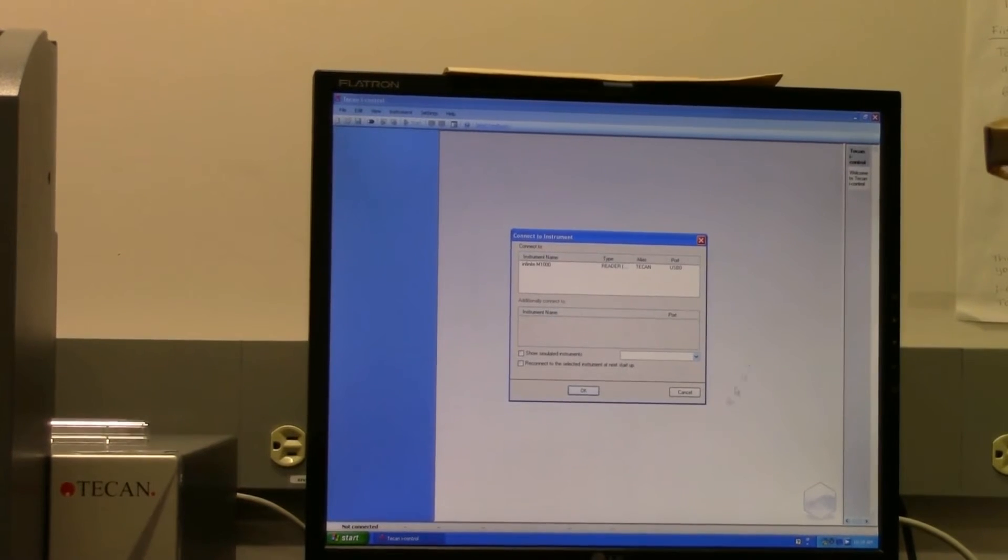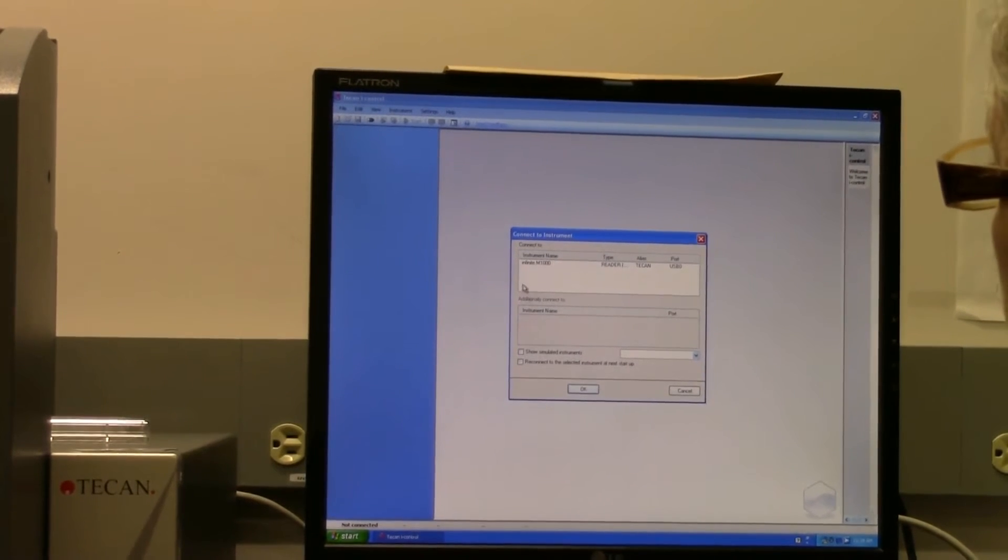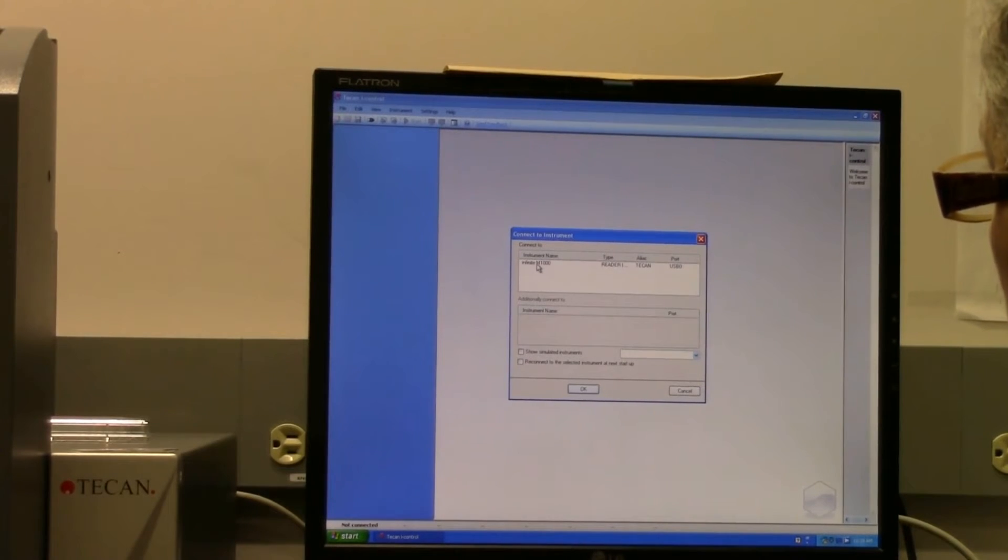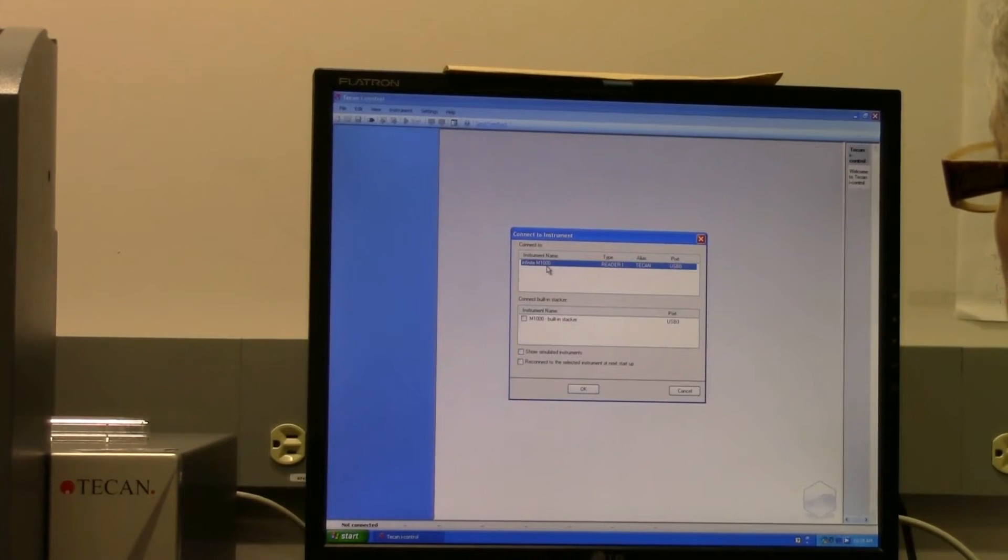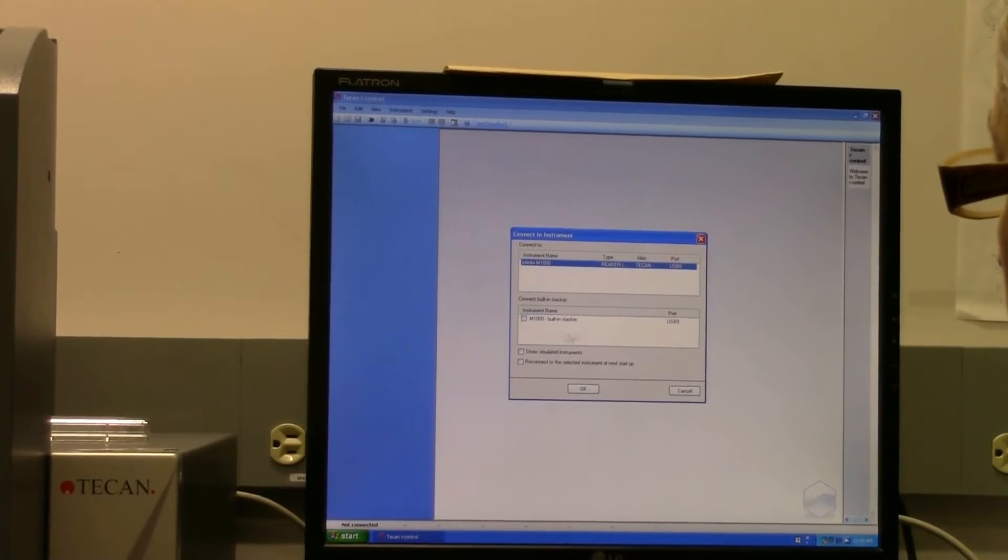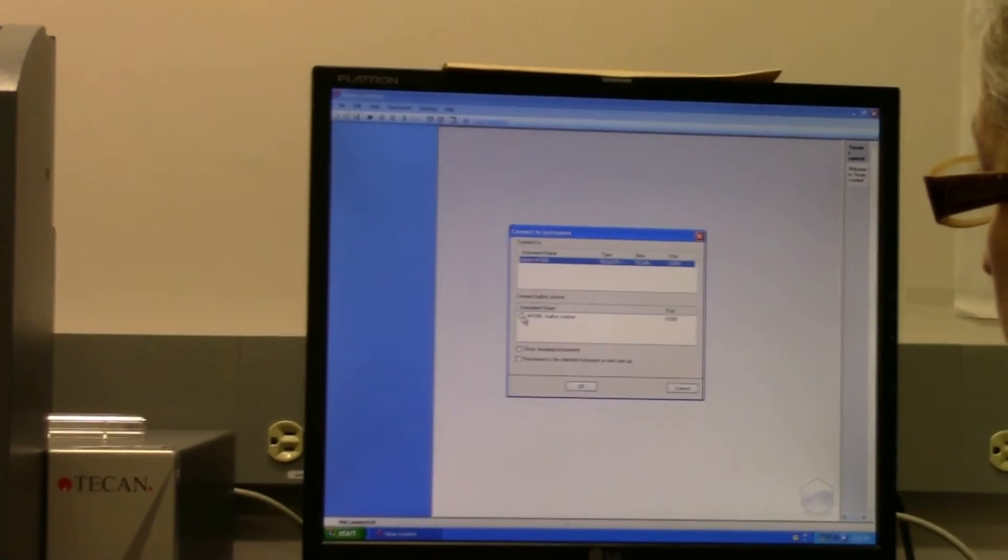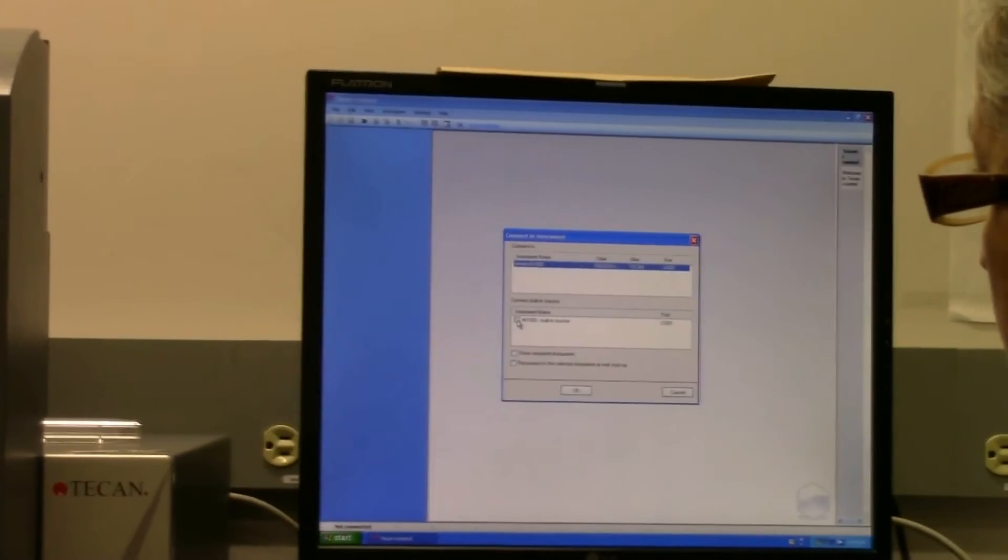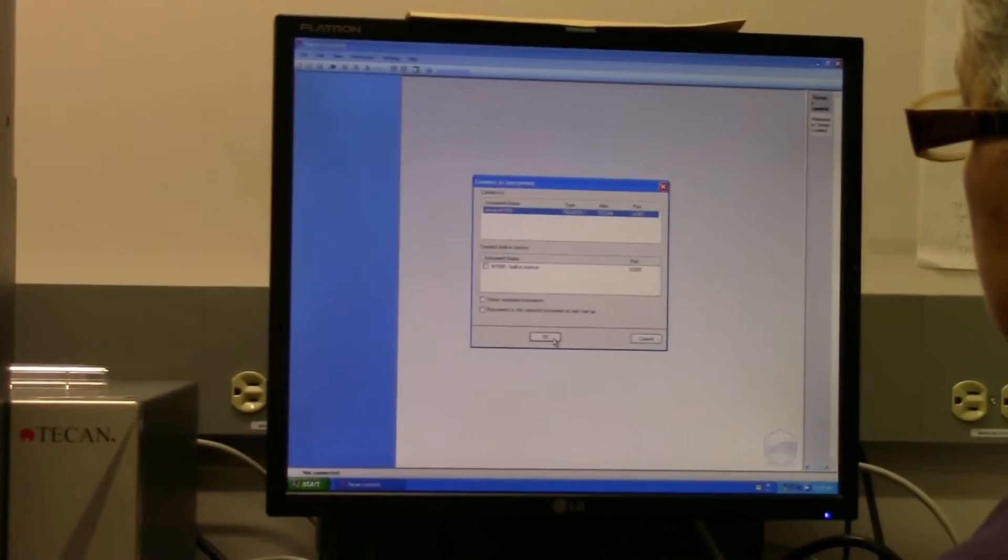Then this window will come up. In order to connect, you click on the instrument name, and if you're planning to use the stacker, which is down here, you would click this, and then you click OK.